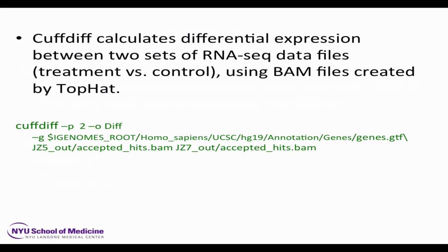There's been a lot of discussion in the bioinformatics community whether they use the appropriate statistical model. Most of the criticism is that it's not sufficiently stringent. In other words, it calls quite a lot of differentially expressed genes, maybe some that by rights should be false positives. That's a detailed conversation for another time.